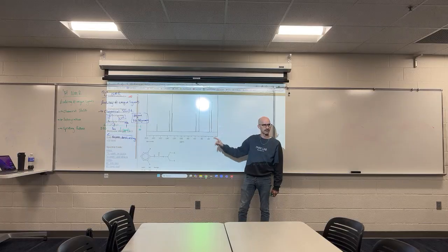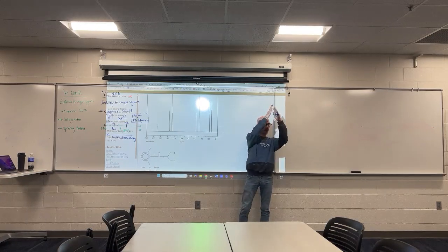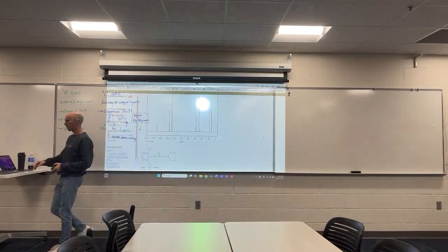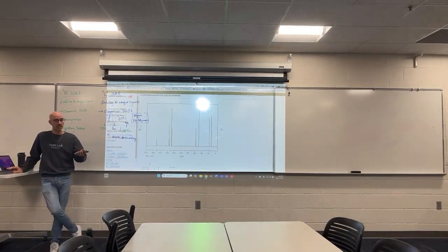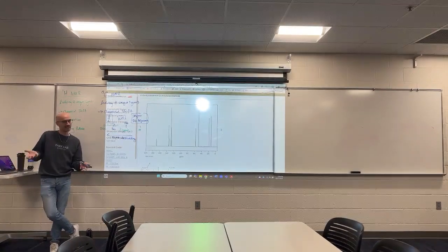There we go. So this was not actually the overlap. That was the pixelation of it, narrowing as it came in. For whatever reason, it just stayed wide for a much longer time. You know, this is an issue with experimental data. It's not always going to be clean for you. It's going to look a little funky. The more time you spend with it, the easier it gets.